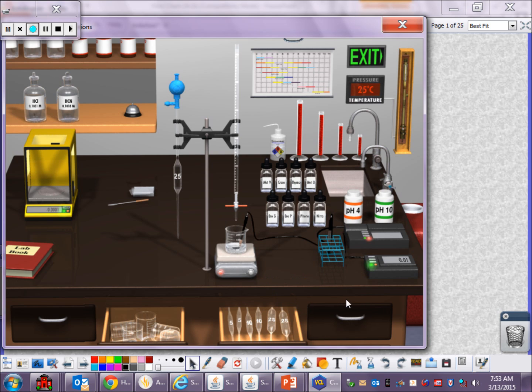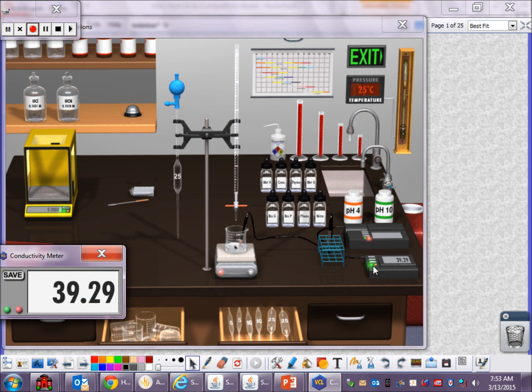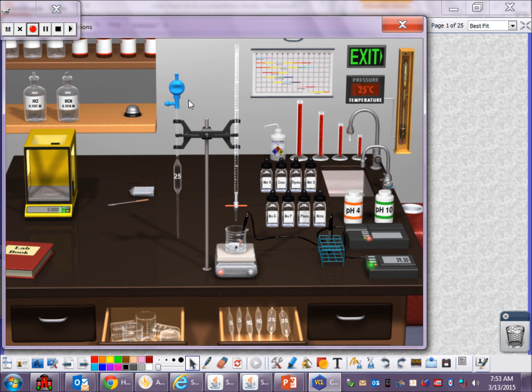HCl. Is HCl ionic or molecular? It is molecular. It is made of two non-metals. But this is very, very strange. It conducts electricity. It does conduct electricity. Ammonia, NH3, is molecular because it is made of non-metals. It still conducts a little bit, slightly. Something is very strange here.